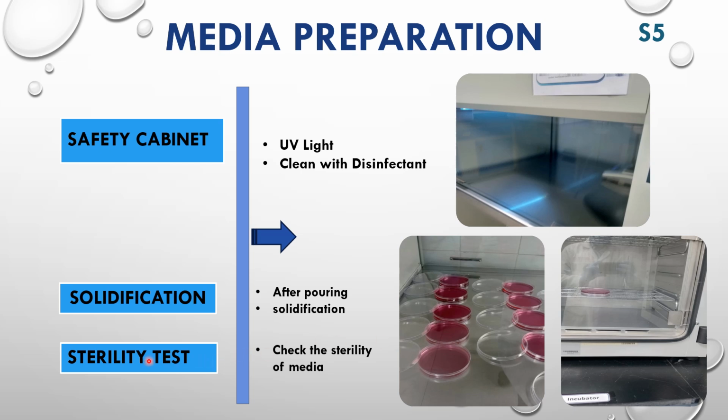After solidification, there is another step called the sterility test. This one is very important, to determine whether the batch you prepared is sterile or not. We need to place some plates in the incubator for 24 hours. All the other plates we place in the refrigerator. We will check them through the incubator.